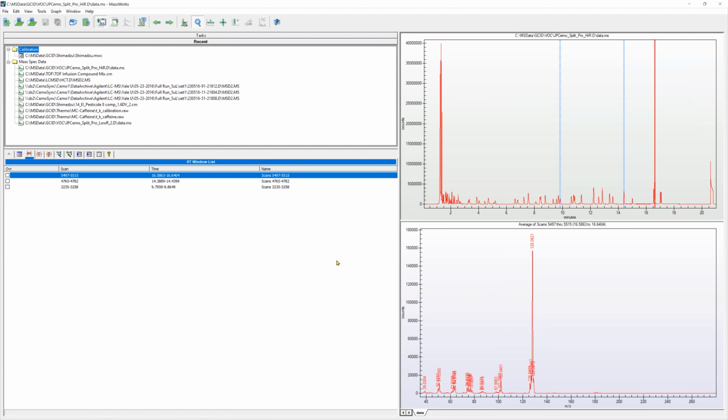But you already did the calibration, so I'm just going to apply it. And in fact, for GCMS, there's a built-in calibration standard, PFTBA gas, and you can turn it on during your method, and the software will automatically recognize it and automatically calibrate your data to accurate mass as well as the line shape, so you can attain high spectral accuracy.